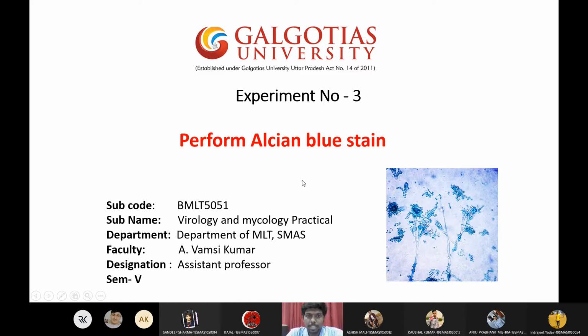Usually, it is really challenging to stain the Cryptococcus neoformans capsule. If you want to stain that particular capsule, we need a specialized stain, and that specialized stain is our Alcian blue stain.